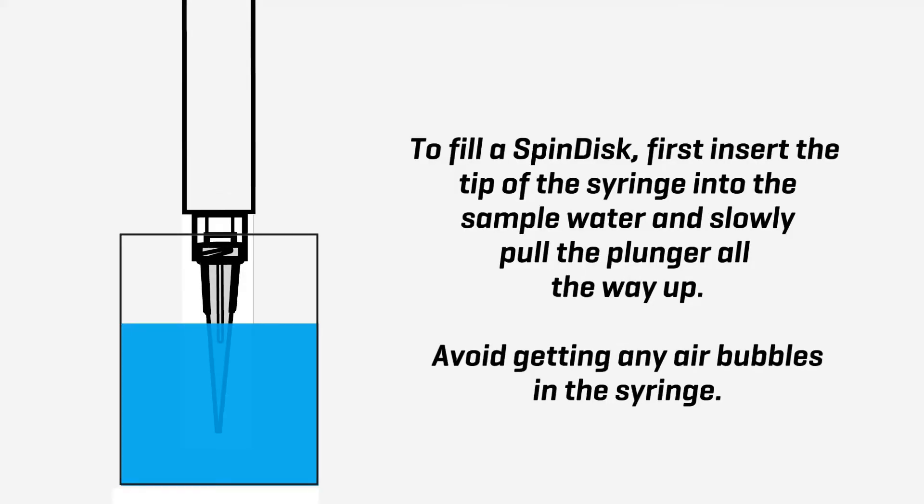To fill a spin disc, first insert the tip of the syringe into the sample water and slowly pull the plunger all the way up. Avoid getting any air bubbles in the syringe.